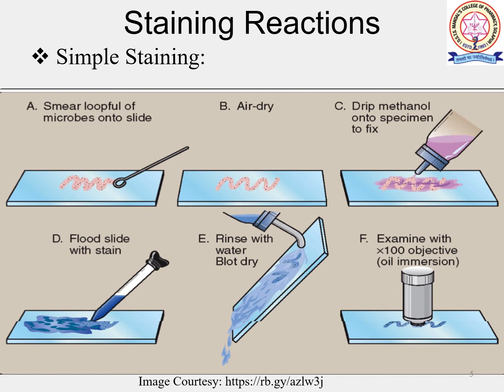Simple staining is useful to distinguish bacteria from fungi. It is also useful to identify the bacterial isolate. Due to their ubiquitous presence, bacillus species may appear as a contaminant in the culture plate, for example growth on blood agar but no growth on MacConkey's agar.